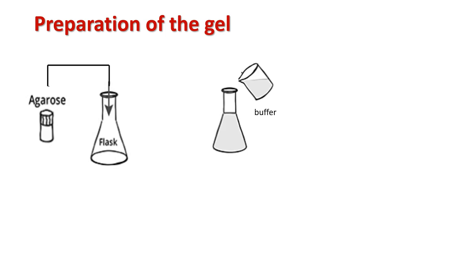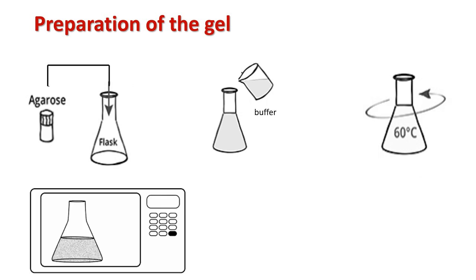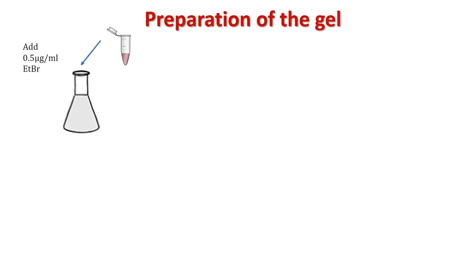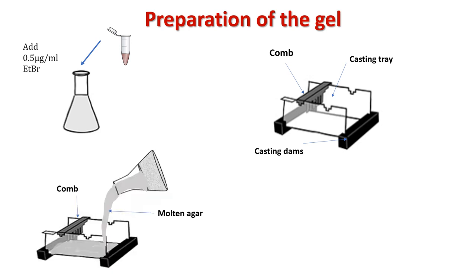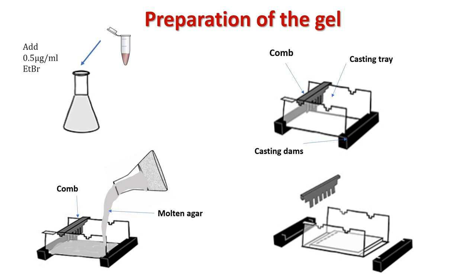To prepare agarose gel, first take the appropriate mass of agarose in a flask and add running buffer, swirling to mix — the buffer volume should not exceed one-third the capacity of the flask. Melt the agarose-buffer mixture in a microwave at 30-second intervals, removing and swirling between each interval, until the agarose dissolves completely. Add ethidium bromide to a concentration of 0.5 microgram per ml. Allow the agarose to cool slightly, then pour into a gel tray with casting dams and an appropriate comb to create wells. After 20 minutes at room temperature, remove the comb and place the gel into the electrophoresis unit.